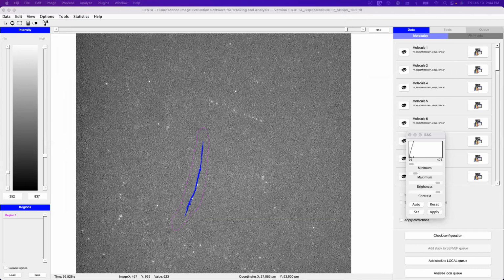The actual movie, let's see the same point here. Next, you can see the drift here. Use Joe's code, you can actually put this together and you get a new movie with no drift. But with Fiesta, the movie is the same, you can still see the drift, but you have the corrected data.